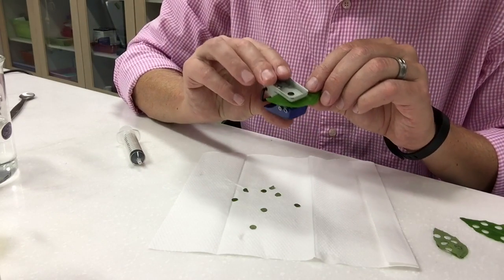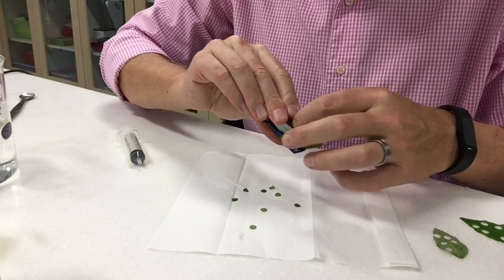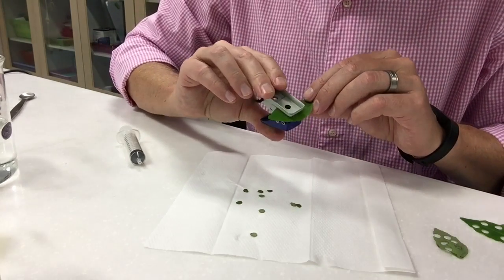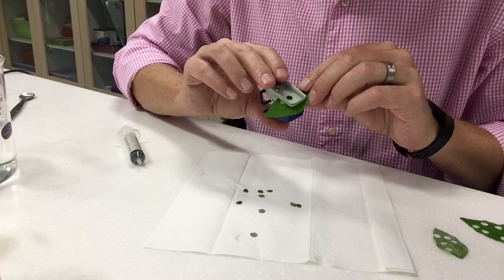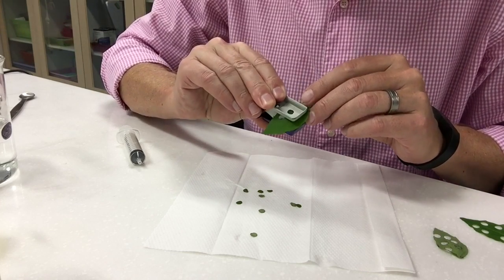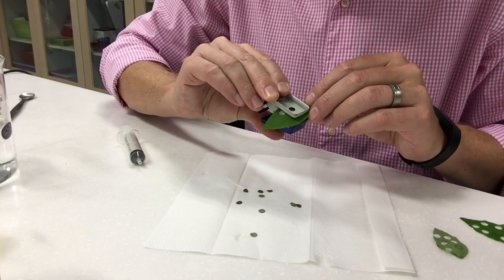So you want to punch about 10 or 12 discs using the hole puncher. So I'll just punch a couple more here. You want to try to avoid getting the large veins involved in the leaf.